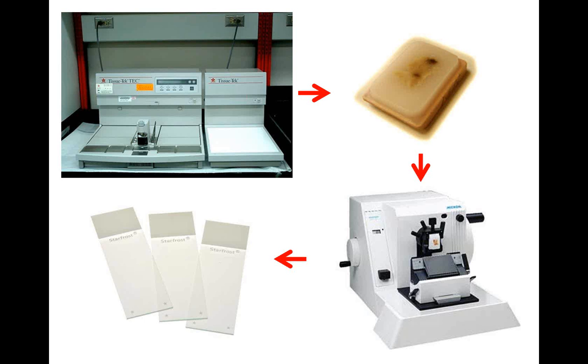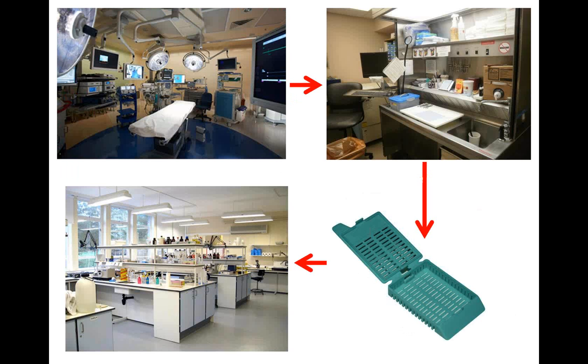However, the only catch is this entire process from start to finish takes at least a day, maybe a day and a half, sometimes 2 days. For example, if we have a tumor that comes out, say, late afternoon, 3 or 4 o'clock, that tissue is not going to get processed right away. It sits overnight in fixative. I won't eventually see that tissue on the glass slides as permanent sections until Wednesday, maybe afternoon. But there are plenty of times during the actual surgery where the neurosurgeon needs to know immediately what he's dealing with, for various reasons we'll get into.